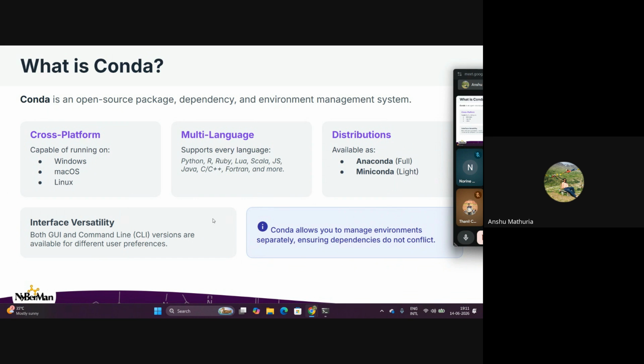So one thing I would like to mention here again, that the kind of analysis that we are doing requires a lot of dependencies. Those dependencies should be installed only in that one environment so that it prevents any clashes from the other environment.